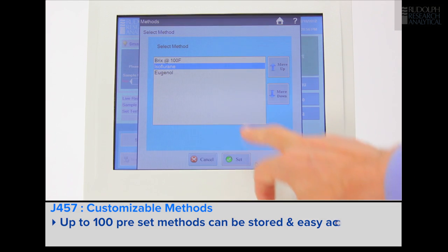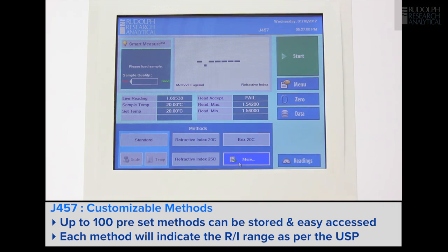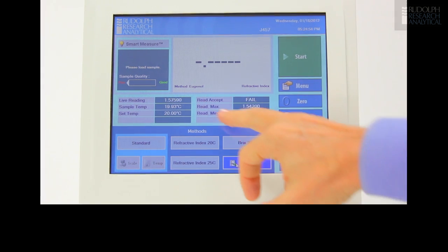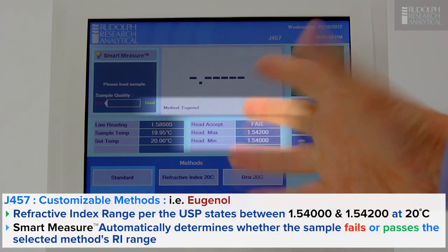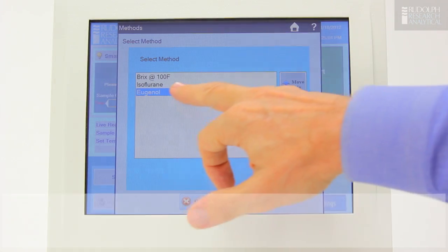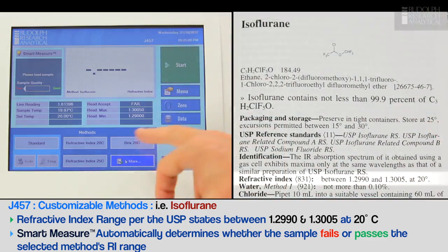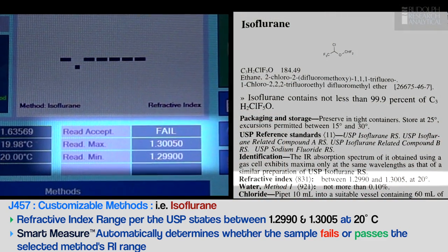The J457 allows a user to set methods and just switch between methods with one key operation. For example, you may have a lab that's measuring eugenol. We first set up for that — it will tell us the range of eugenol according to the USP and whether it's a pass or fail. An example might be isoflurane. Select isoflurane for use with the United States Pharmacopeia. The specifications for isoflurane will tell us once again pass or fail on the material.